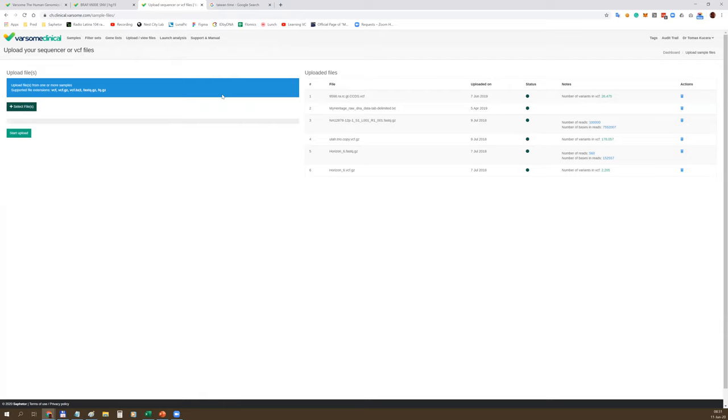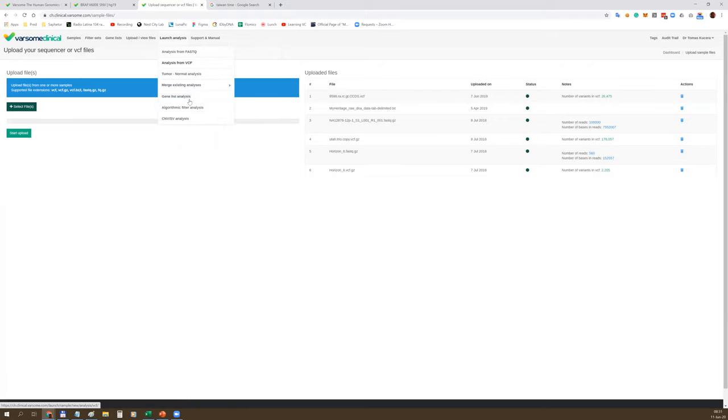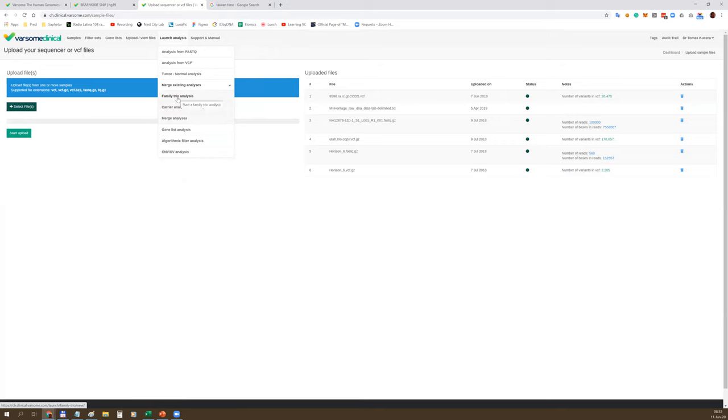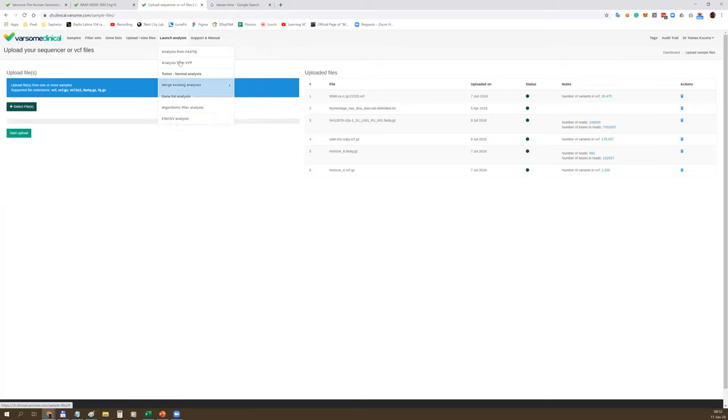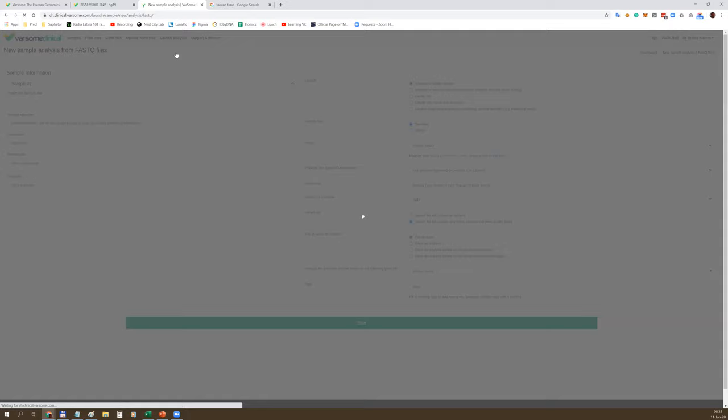First you should upload your data. You can select your files directly from your computer and send it over the internet to our servers. There is also an API - application programming interface - available, allowing you to automate every step of the analysis. Once you upload your data, you can run the pipeline. We have a number of pipelines starting from FastQ, from VCF, tumor-normal analysis, trios, carrier risk for couples.